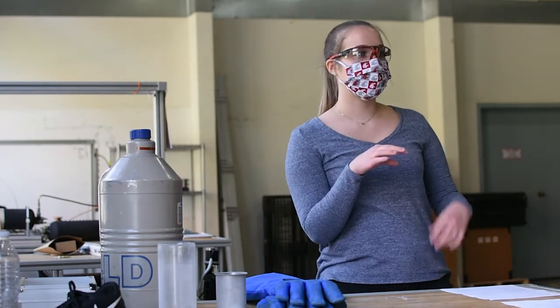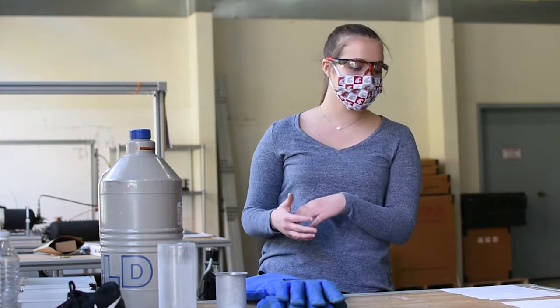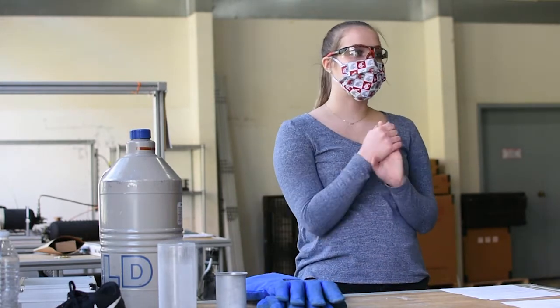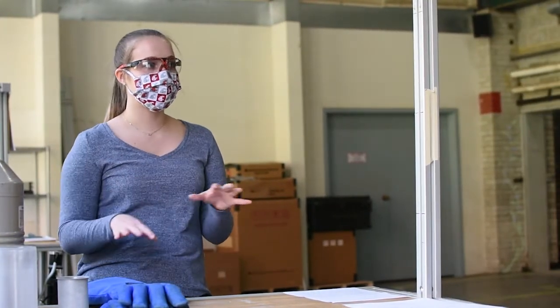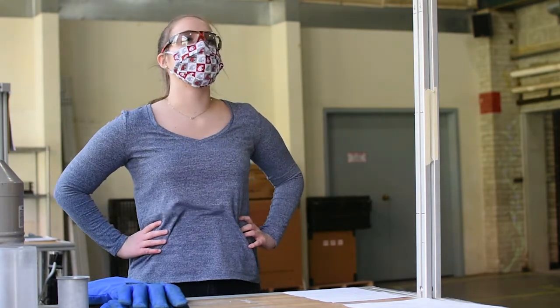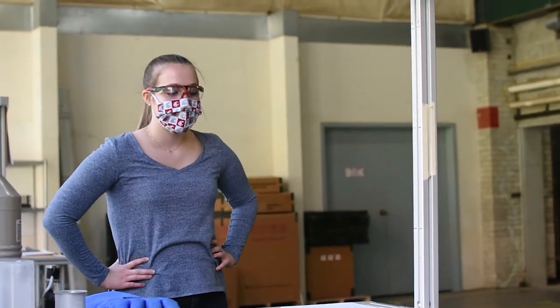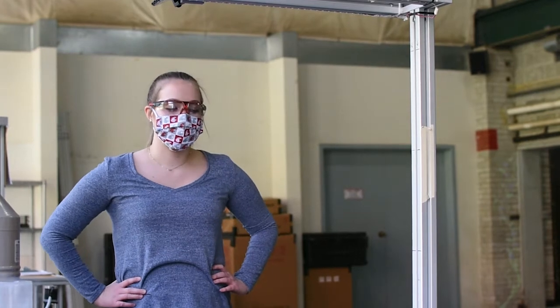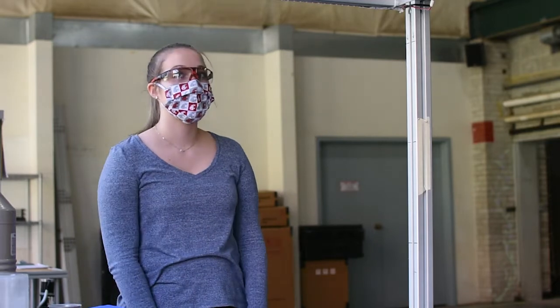Liquid nitrogen, when it expands from its boiling temperature to room temperature, occupies a volume 703.6 times larger than the liquid state. And another thing is, if you were to fill a container completely full with liquid nitrogen and let it boil to room temperature, it can actually reach a pressure of, I think the number is 42,196 psia, which is a really big number. So to demonstrate this, we have a pretty cool demo lined up.